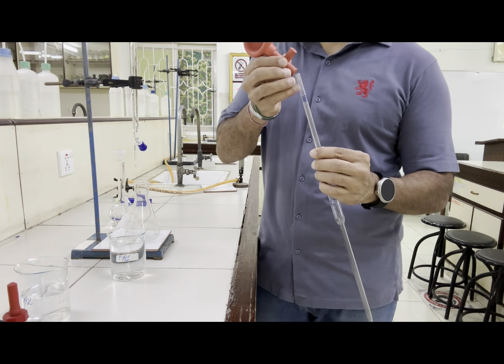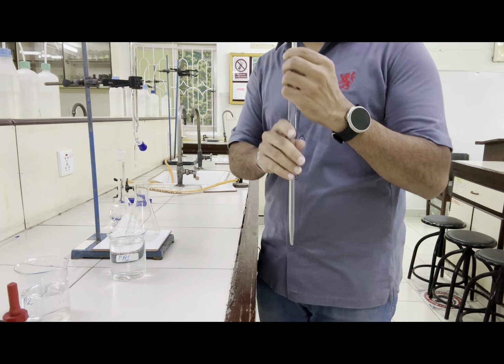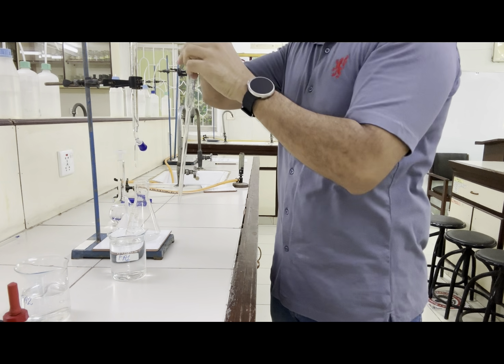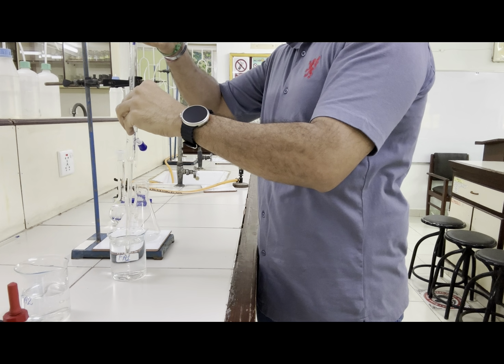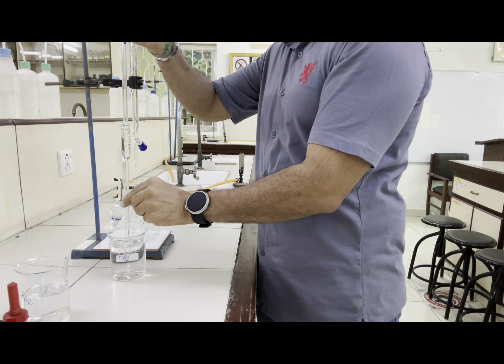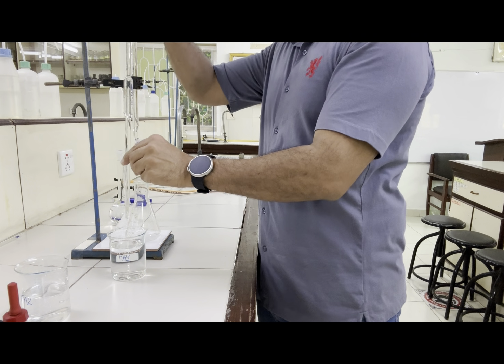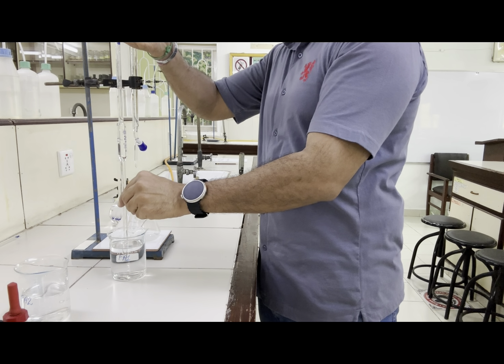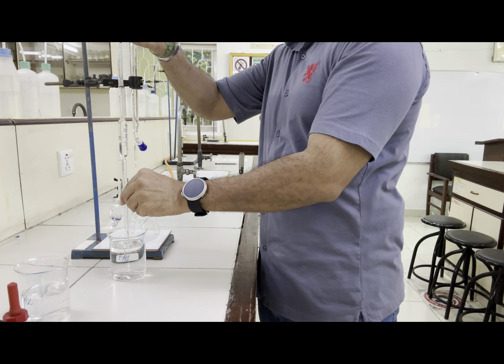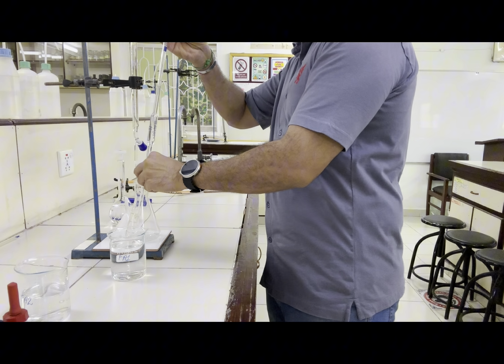We will attach this pipette filler here, and then we will take 25 centimeter cube of Fa1. So here is our Fa1, 25 centimeter cube up till the mark. And transfer this into the conical flask.